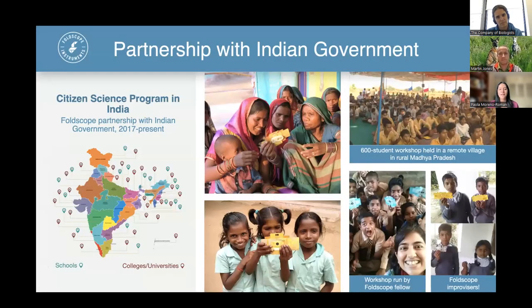So I'll mention a few examples of different partnerships we've had with different organizations and programs we've deployed. One of them is our partnership with the Indian government. It started in 2017, then went on hold for a few years because of the pandemic. But we were able to cultivate an amazing community of Foldscopers in India. And we actually have people there who are still constantly leading Foldscope workshops on a daily basis. They've incorporated it into their school curriculums and so on. And here are some images of different workshops. For example, this one was a workshop for 600 students in a remote village in India.